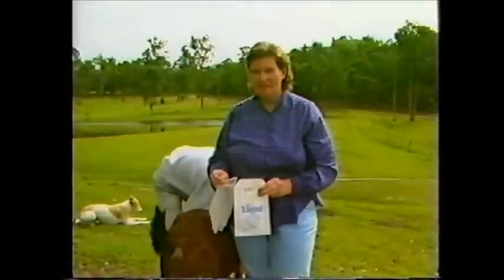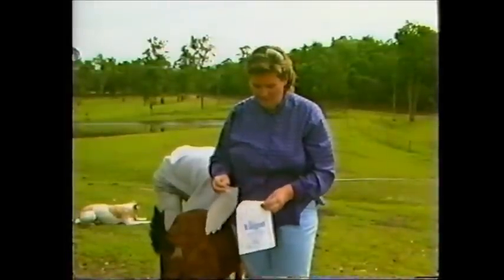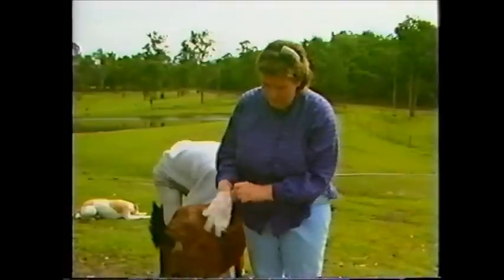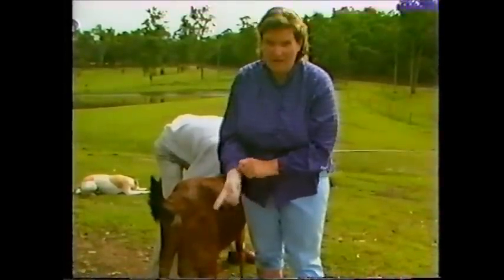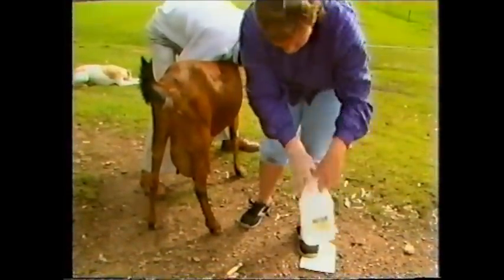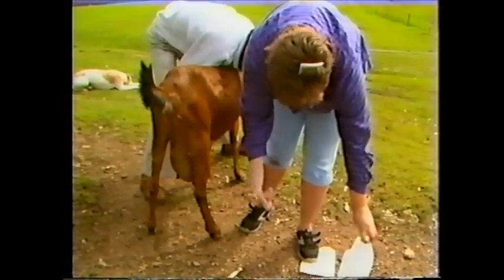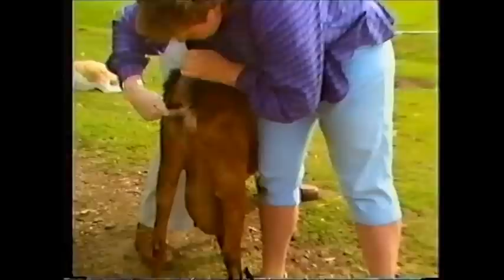It's frequently necessary to take fecal samples of goats. To do this, you use a plastic disposable glove and lubricate your index finger with some obstetrical lubricant or something similar. The finger is then inserted into the goat's rectum and fecal pellets are removed.